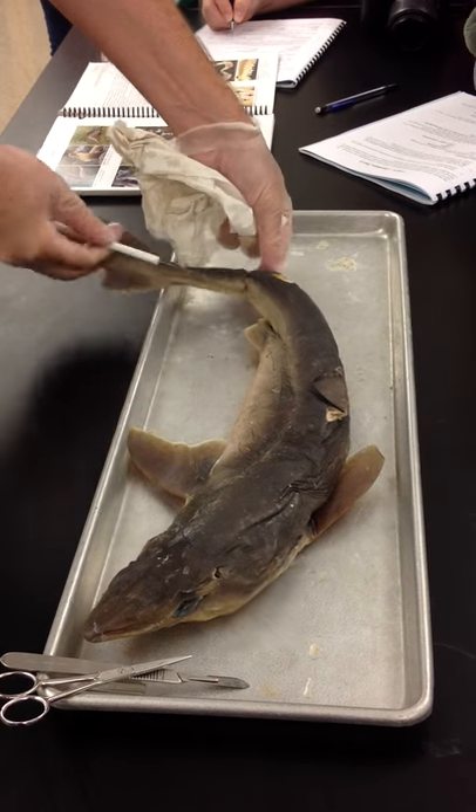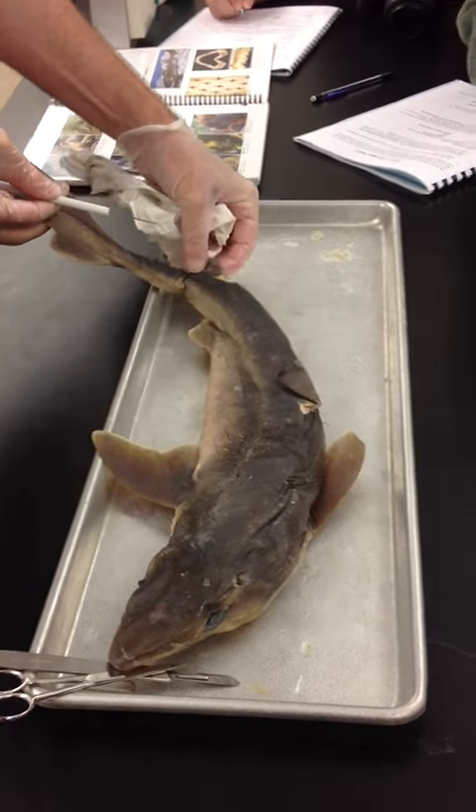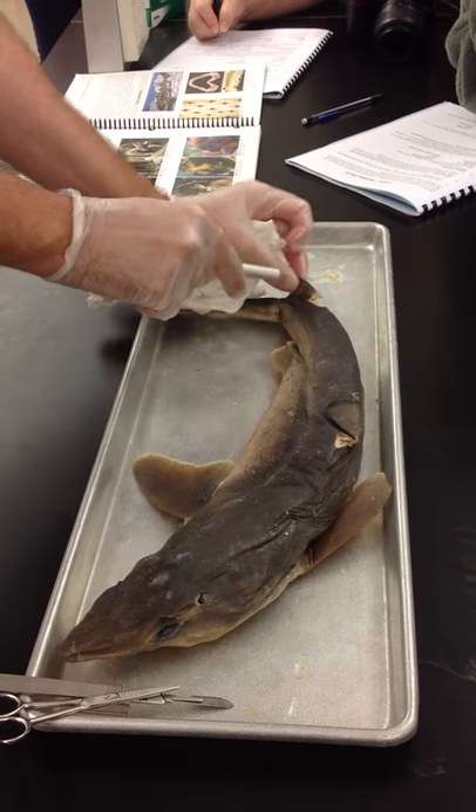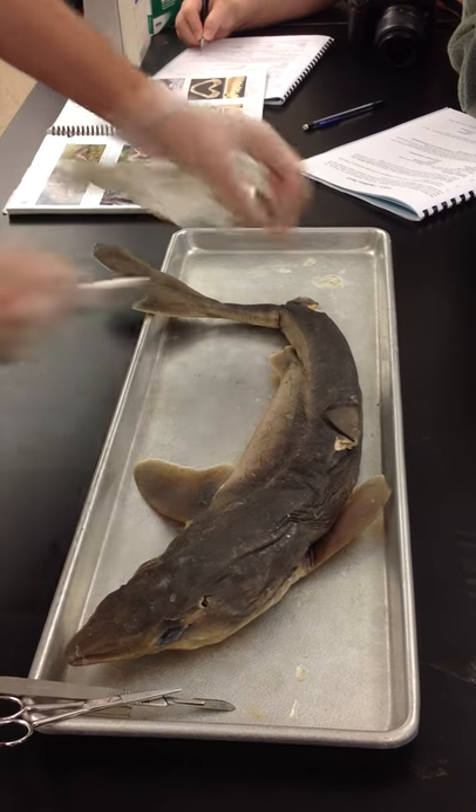This back here is the posterior dorsal fin. That's the posterior dorsal fin — dorsal on the back, posterior towards the tail.